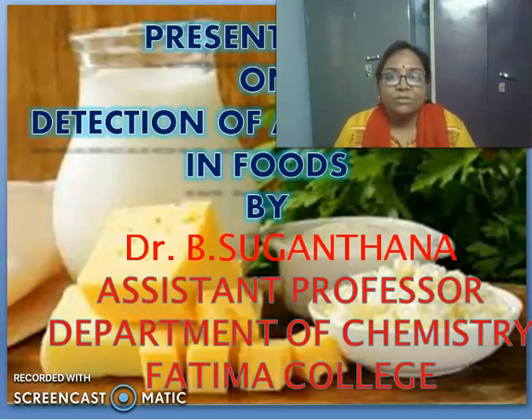Good morning, everyone. The topic today I'm going to deal with you is detection of adulterants in food items, both in solid food items as well as in liquid foods.